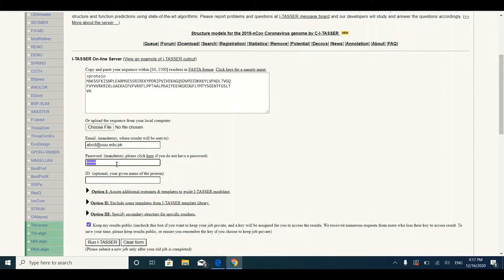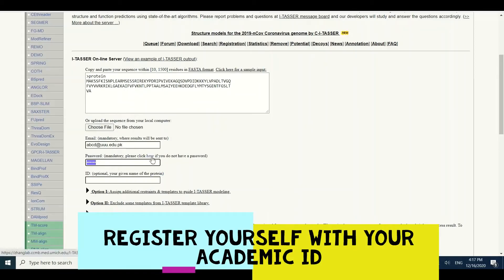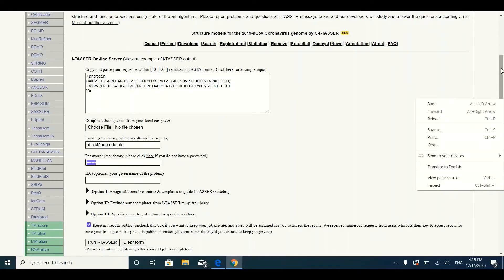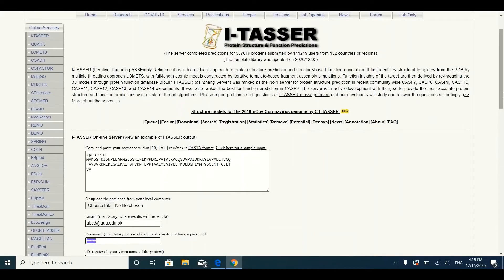To get the password to submit a job on the I-TASSER server, you need to click on 'Click here' to register yourself with the I-TASSER server. I-TASSER will then send you a password, which you will use when submitting this job. After giving your credentials and protein sequence, simply click on the 'Run I-TASSER' button to submit your sequence to the server for three-dimensional structure prediction.